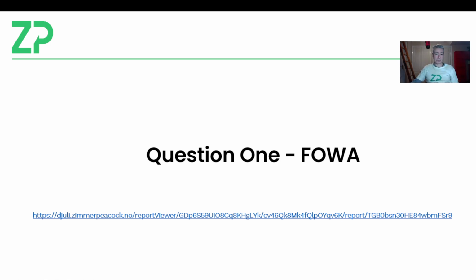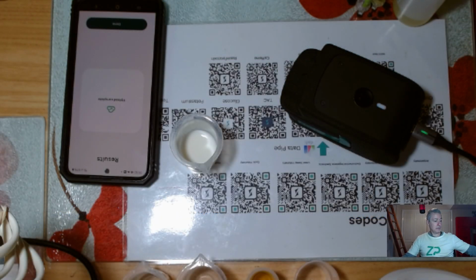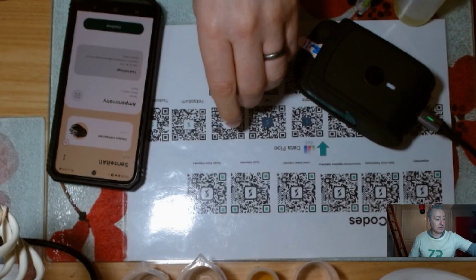I'm just going to go to my camera for a second and grab a ZP electrode. I'm also going to turn around and grab some ferricyanide. Ferricyanide may appear later on as well, when I make some comments about an immunoassay. I think that's in question number 2, and I have a strong suspicion that in the immunoassay they're also using ferricyanide or ferrocyanide.